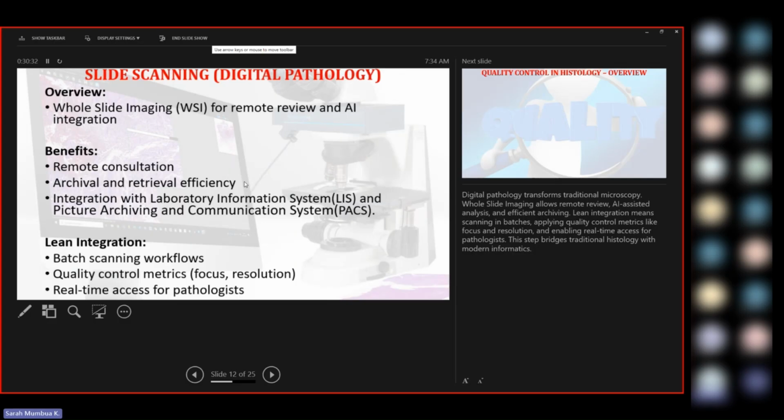If you don't have the digital platform, just the slides are ready for microscopy. This is mainly done by the pathologists. I know most of us are fighting, we're thinking maybe, why are the pathologists coming to report slides in our labs? But I don't take it as a big deal. I think that's okay. You already have much to do.